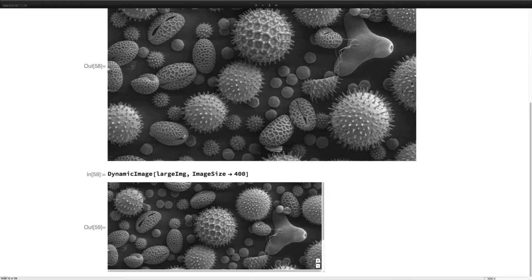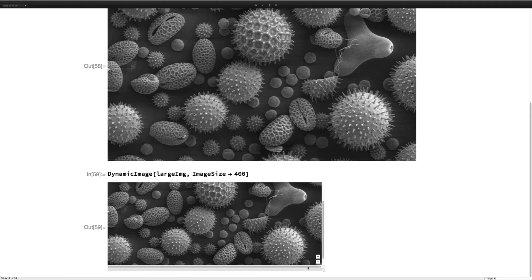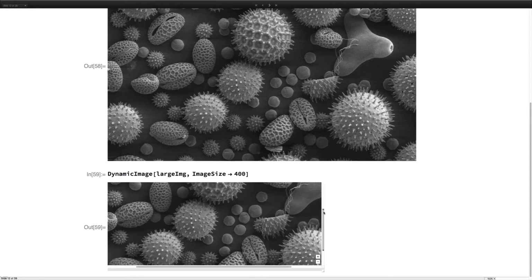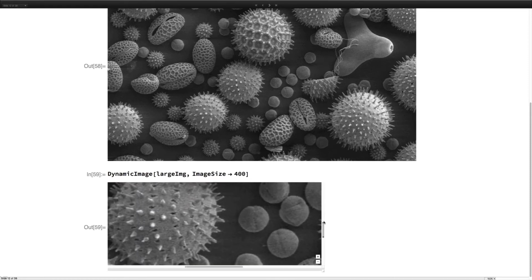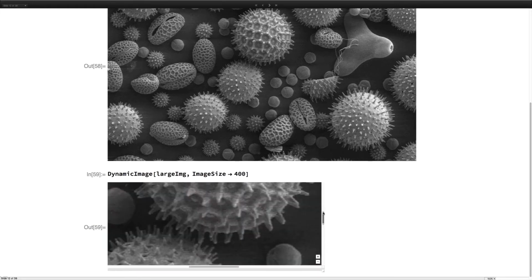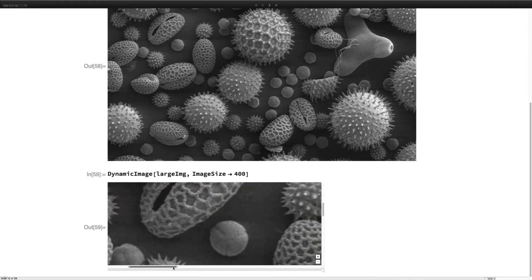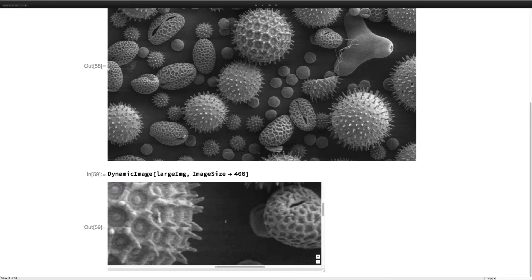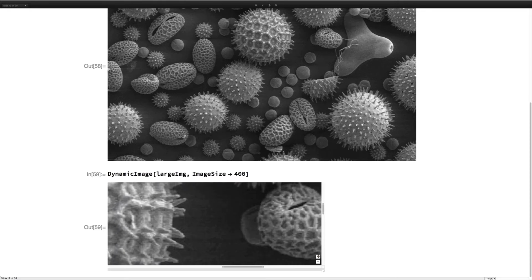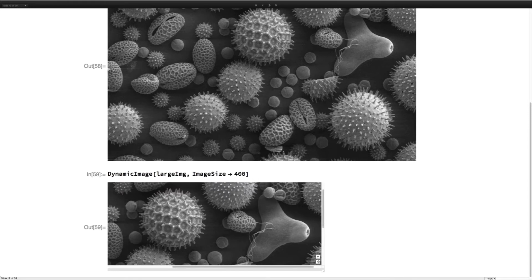And then you see on the side some awkward looking scroll bars. They allow you to scroll to any position. But not only that, they have these knobs at the end where you can actually zoom in by making the scroll bar smaller, or zoom out. And so the scroll bar even gives you a kind of first-hand indication where you are in the image and how large your image excerpt is. You can pan around in the image. You can hit the zoom button to go further in. You can hit the zoom button to go further out. So essentially a nice tool to view images that tend to be large.